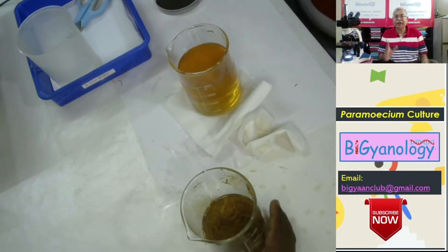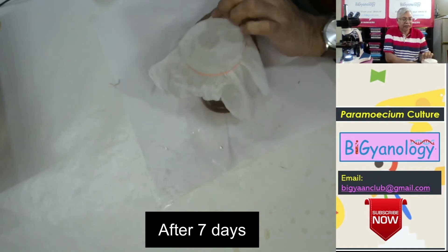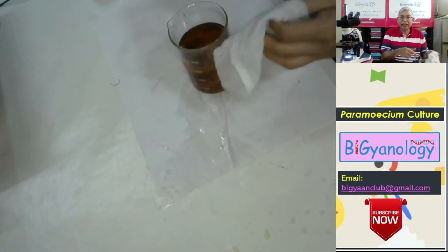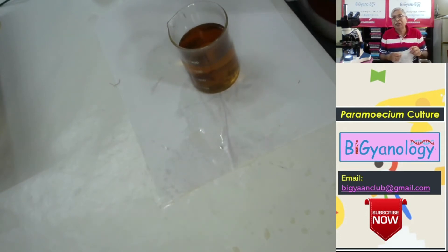So let's wait for a day. After 7 days we got this paramecium culture. Now I forgot to tell you: when you have this hay infusion, please keep it covered. If not, mosquitoes love this water and they will start laying eggs, and so your paramecium will be eaten by mosquito larvae.